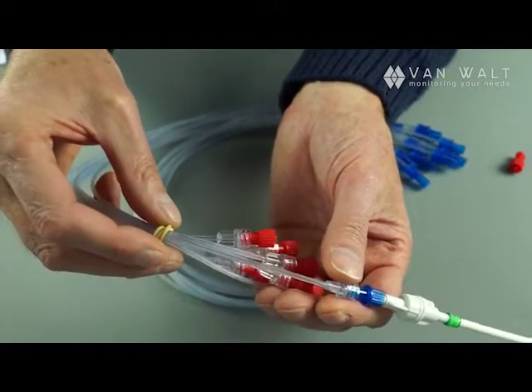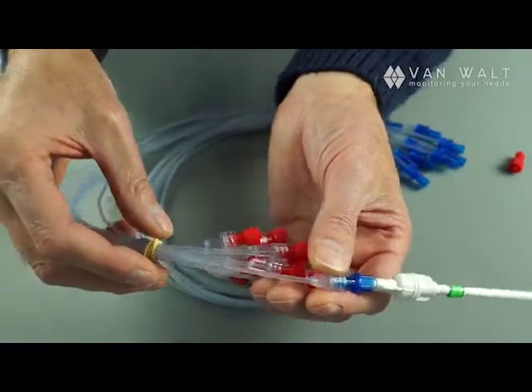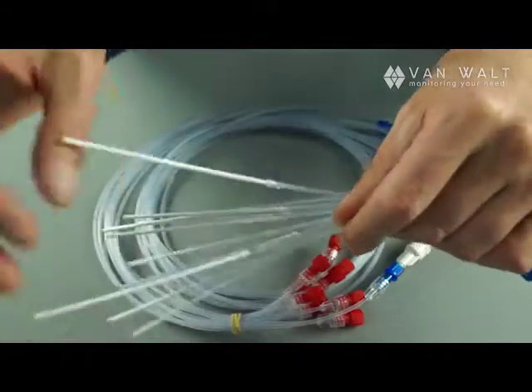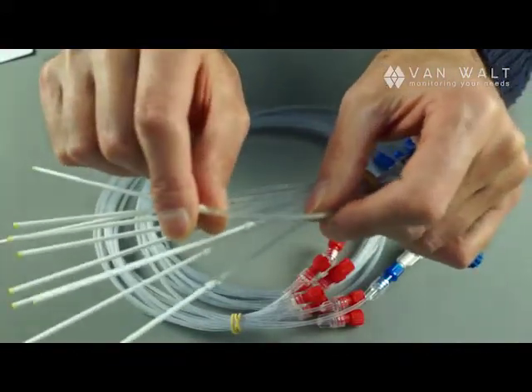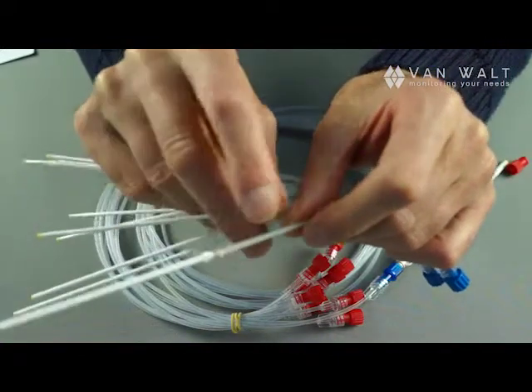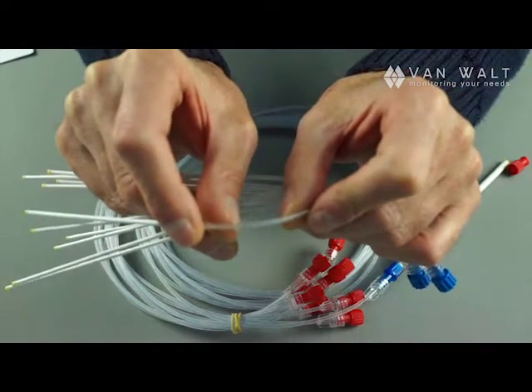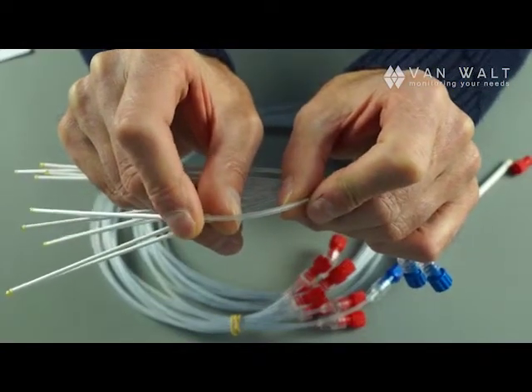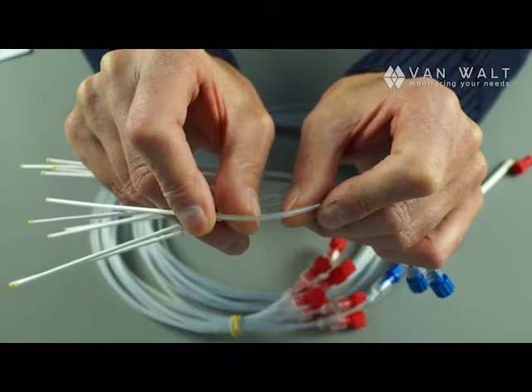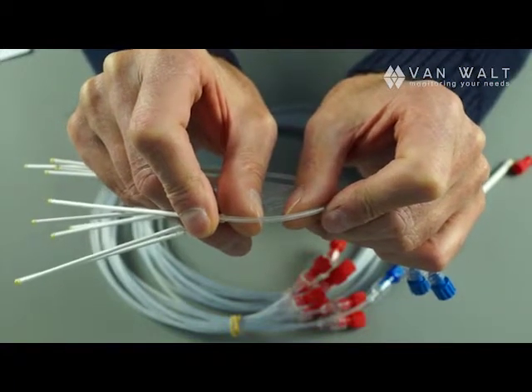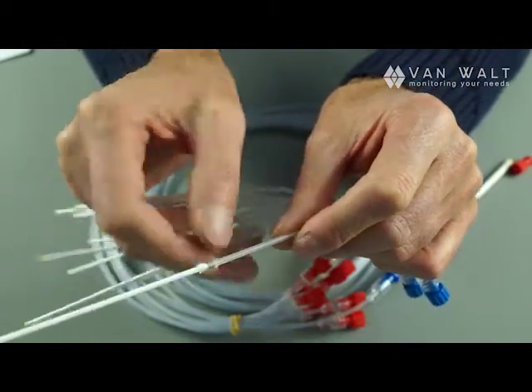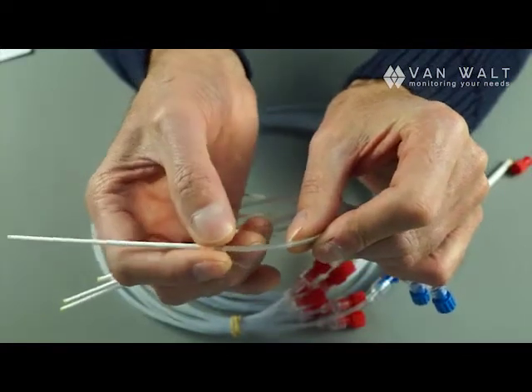The capillary tube is led to the surface and normally there is some backfilling with materials such as bentonite. One thing that is important: inside the rhizome samplers, because the capillary is very flexible for the first bit, to make sure that it doesn't kink, there is a strengthening wire. In this particular case with the macro rhizomes, this strengthening is done with a fiberglass section. Fiberglass is used because if you use something like stainless steel and you are analyzing for metals, you could get cross contamination. So there are two types, either with a stainless steel strengthening wire or a fiberglass strengthener.